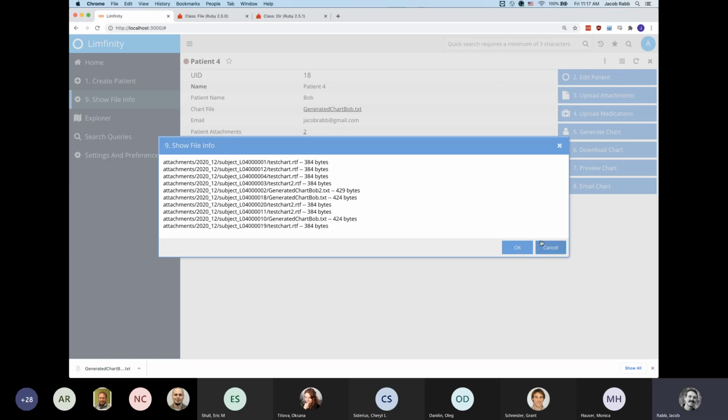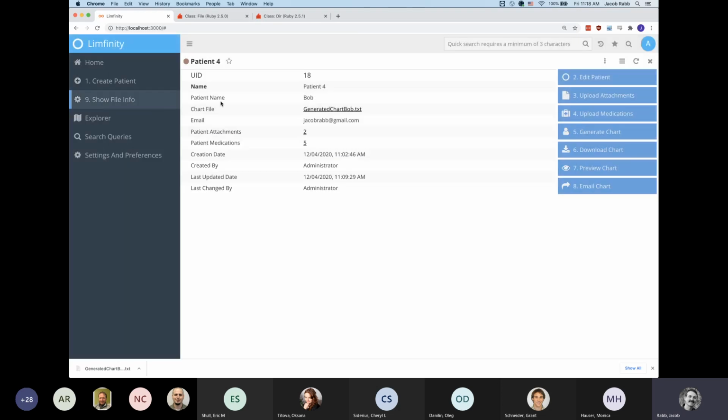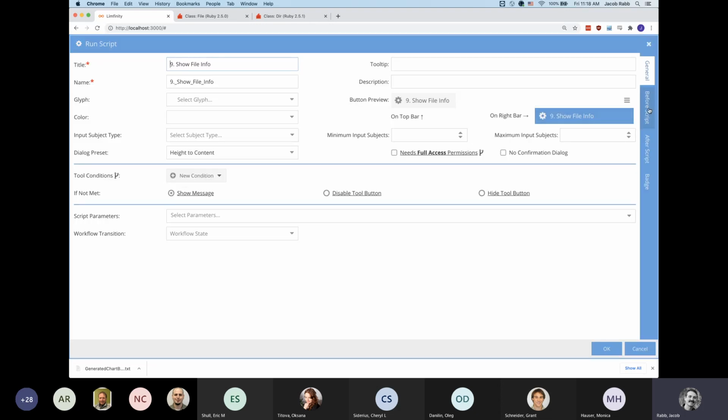But what's more interesting about this is how this is actually generated. If you ever do need to iterate over files on disk, it's fairly rare that you need to do this inside of the configuration. But sometimes there will be use cases. Before, I've had to send all of one of our clients' PDF files to an external SFTP site. And rather than building that into the configuration, I just went onto the server and ran some code to do it. So this is an example of how that code works.